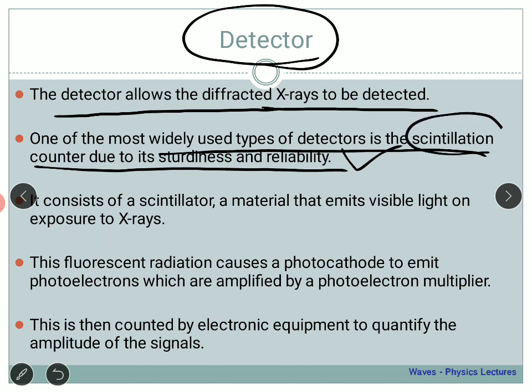We have already done this in this semester. I have also uploaded the lecture on YouTube, so you can check it and revise this again. This is how our detector works. It will basically have a photomultiplier tube, which will improve the signal and so on.